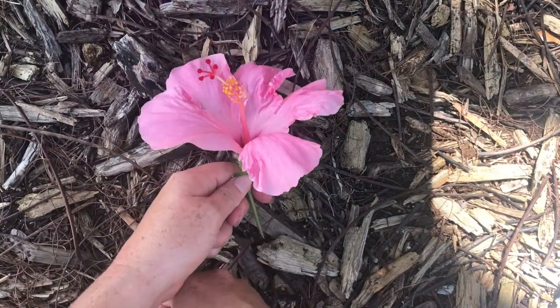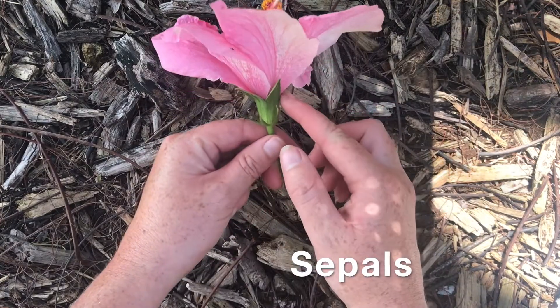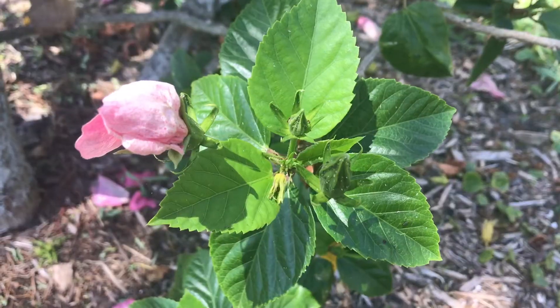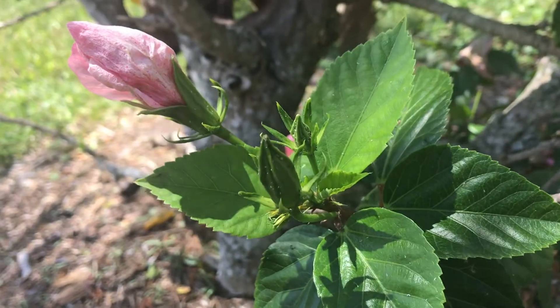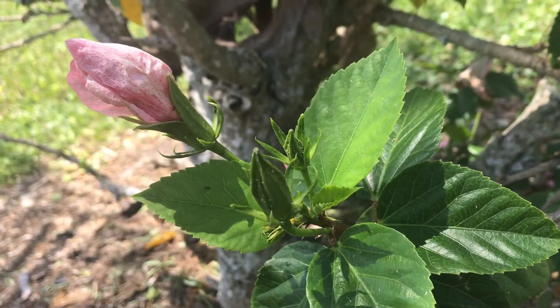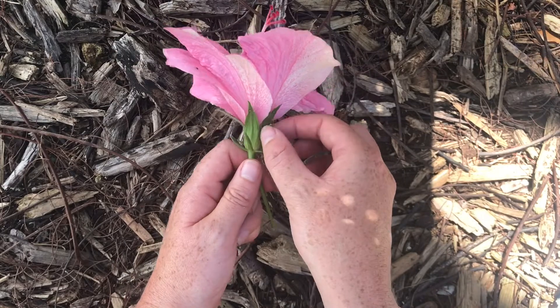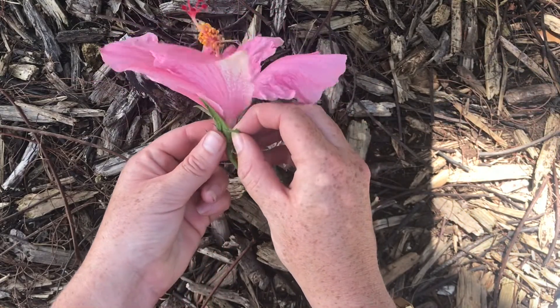For the first part of our dissection, we're going to remove the sepals. These are the small green leaves down here at the base of the flower. They're actually the first part of the flower that will form. They form a tightly closed little ball at the top of the stem called a bud, and they help protect the flower as it's developing — they'll stop it from drying out. To remove the sepals, just gently pull down from the flower towards the stem and pull them off in small pieces.